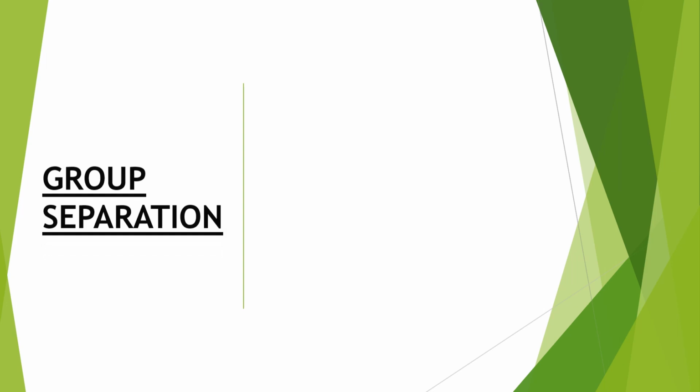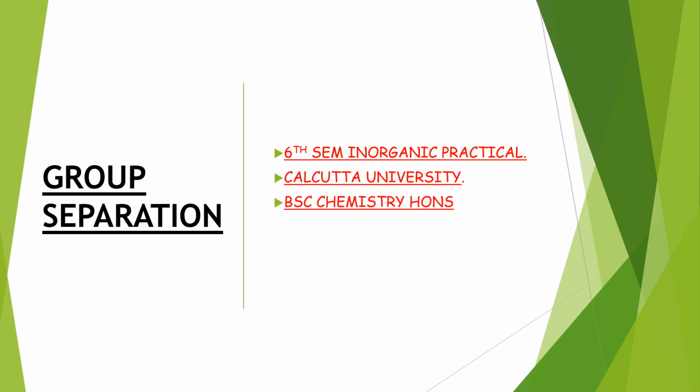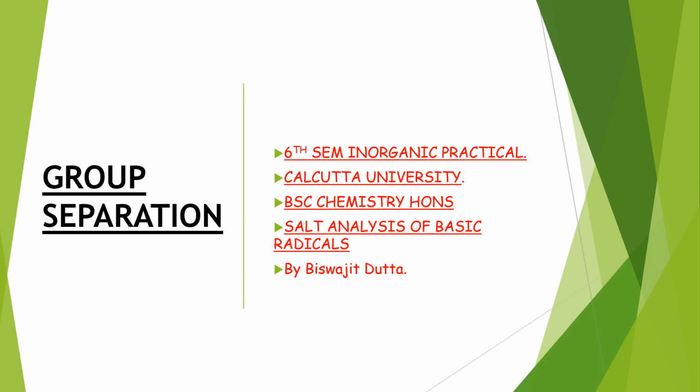Hello everyone. Now we are going to learn group separation. Group separation is present in our 6M inorganic practical under Calcutta University in the course of BSc Chemistry Honors. Group separation is very useful for salt analysis of basic radicals, which are mainly cations.